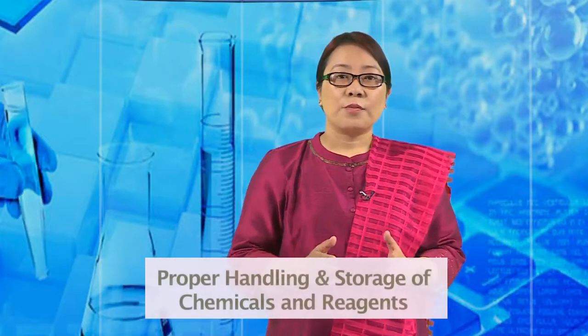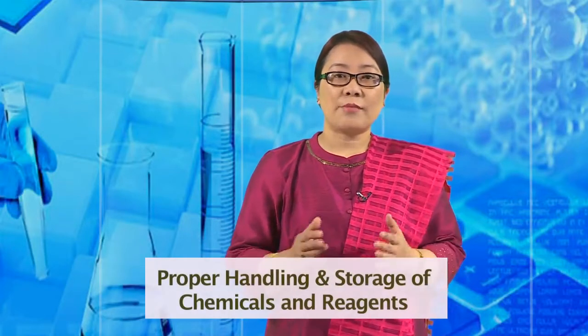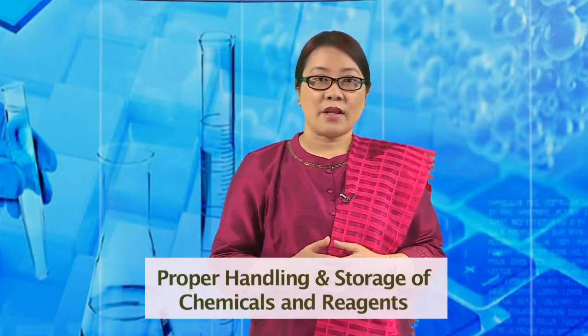Since a typical cell biology lab may be using some hazardous materials, it is important to prevent unauthorized entry to the labs, secure the hazardous materials against theft, as well as ensure compliance with security regulations to prevent unwanted accidents caused by exposure to the highly hazardous materials. Next is proper handling and storage of chemicals and reagents.